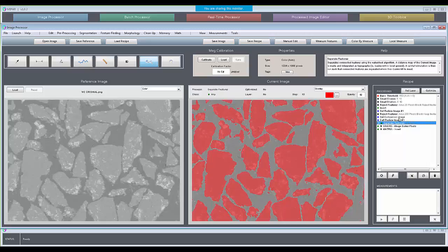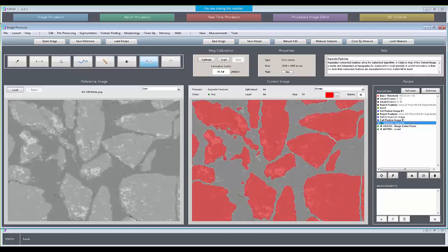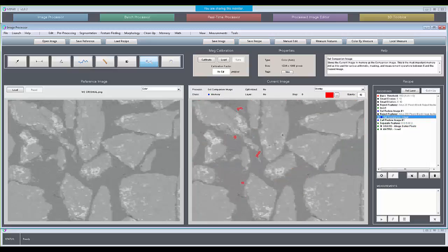And then I only did that memory dance because sometimes the separate features can do some funny things to the really small ones. As you noticed, these guys got clipped in strange places, but we have those small features preserved in their pre-separation state right in here.